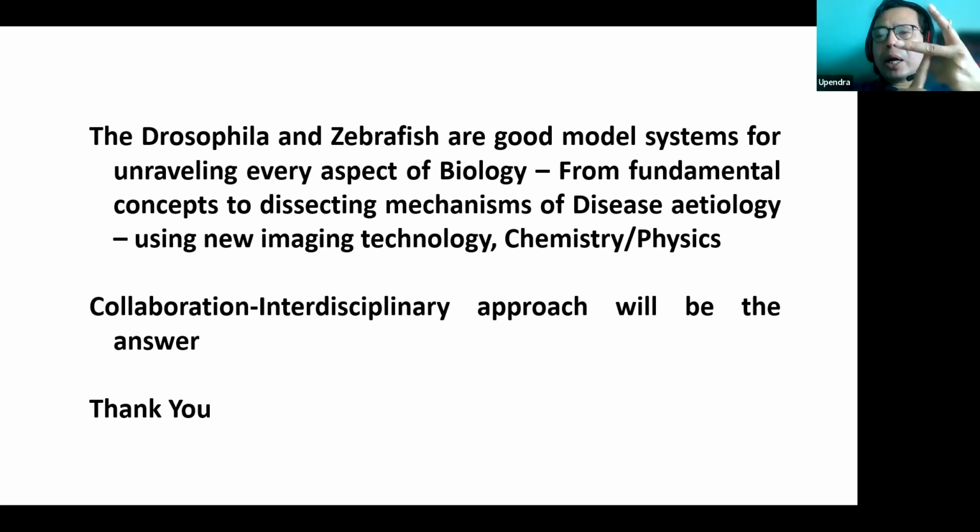Once you have acquired it, I think Partha must have explained, it is not only about acquiring the images, but how to resolve those images. You need to develop many image processing methods, so that you can see them properly, because there are still many ways you can see the things.